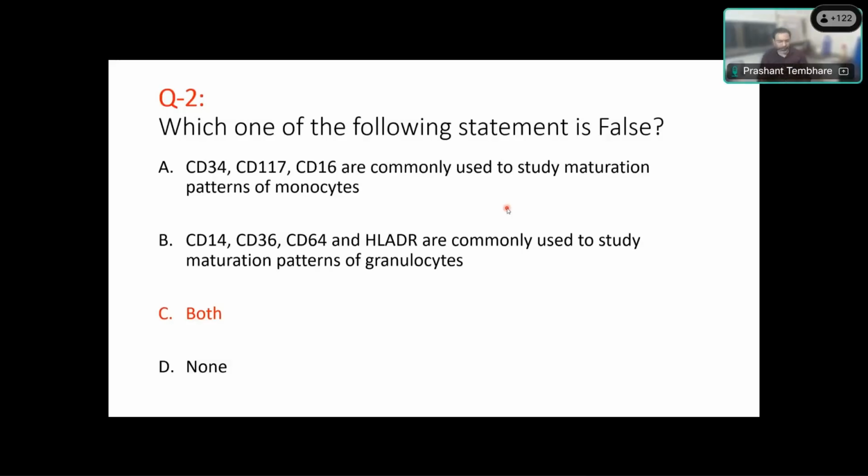There are studies published in CMML, chronic myelomonocytic leukemia, on these compartments of classical, intermediate and non-classical monocytes, and you are studying normal people. In MDS also you are studying these aberrancies in known, well-established cases of MDS, morphologically and genetically established, as well as the normal. So you have healthy controls and well-established positive controls.